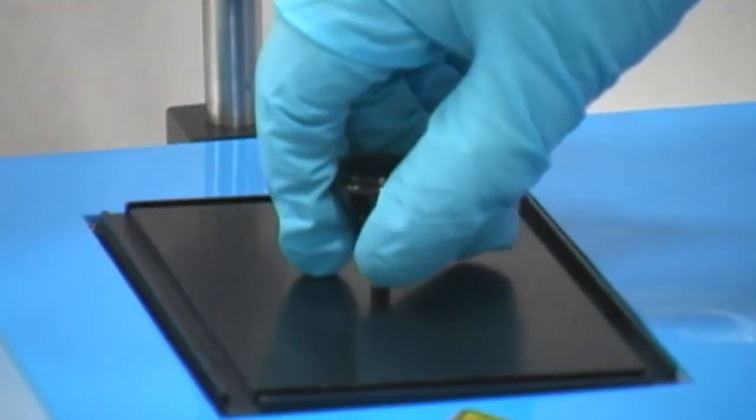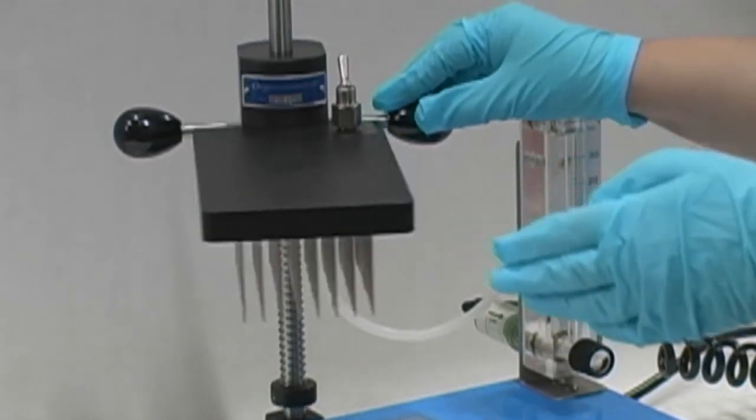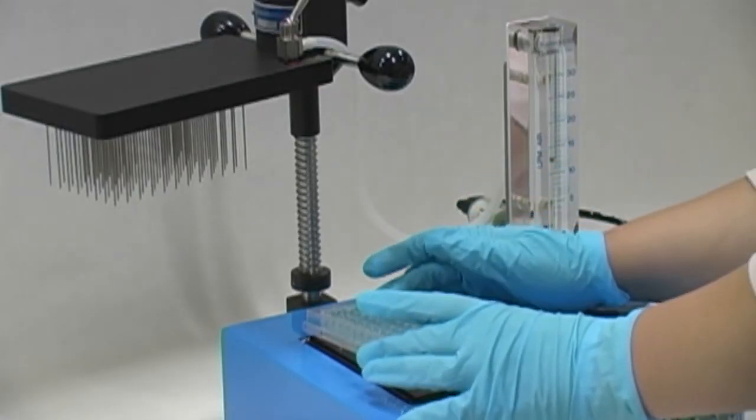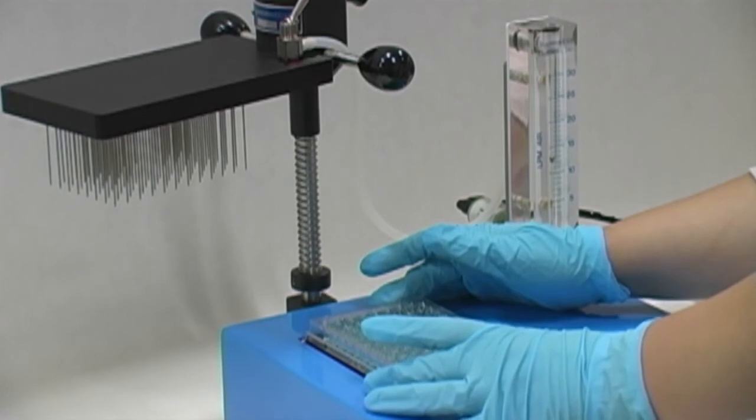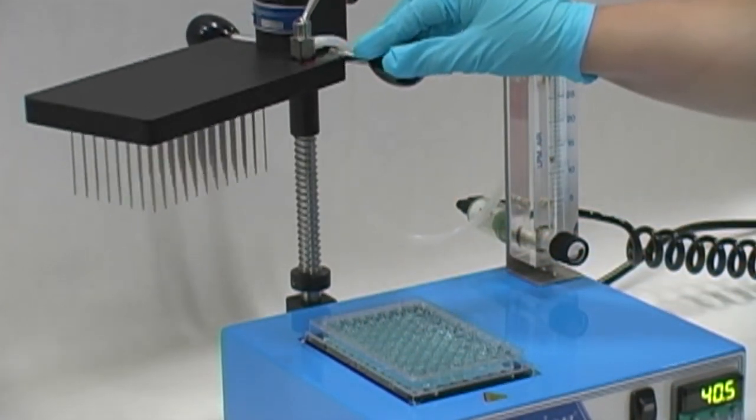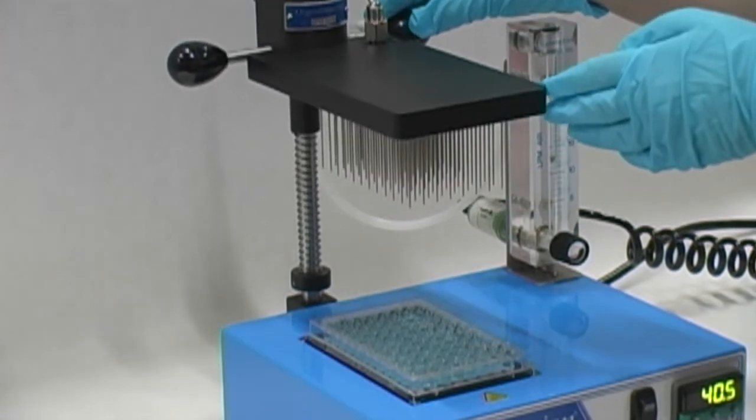Preheat the heat block. Swing the manifold away. Place the microplate or sample tubes in the heat block. Re-center the manifold above the samples. An audible sound will indicate that the manifold is positioned in the alignment groove of the rod.